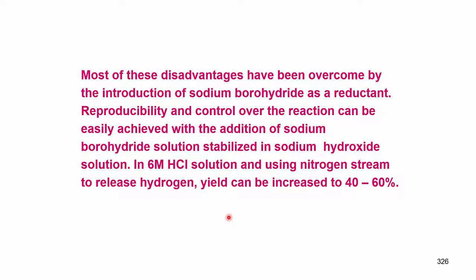You can just add a small tablet of sodium borohydride, it works. Reproducibility and control over the reaction can be easily achieved with sodium borohydride solution, which we have to dissolve in sodium hydroxide basically.